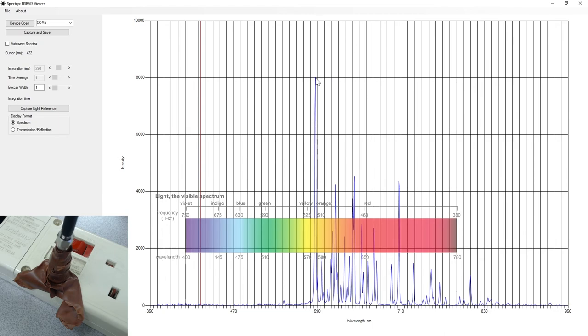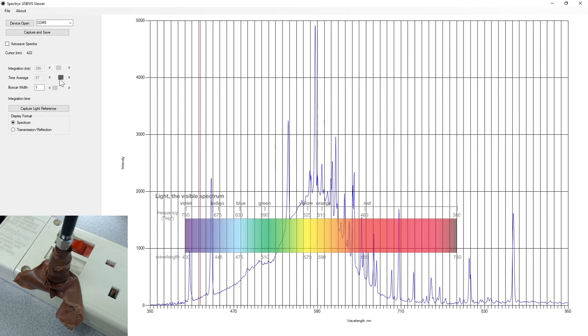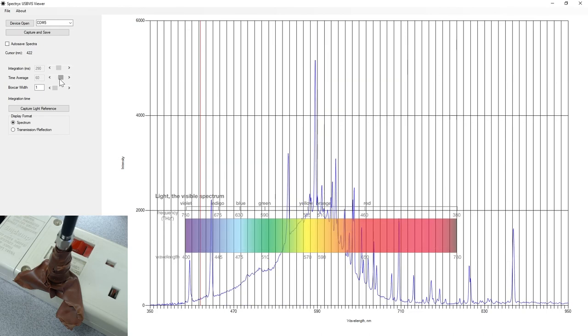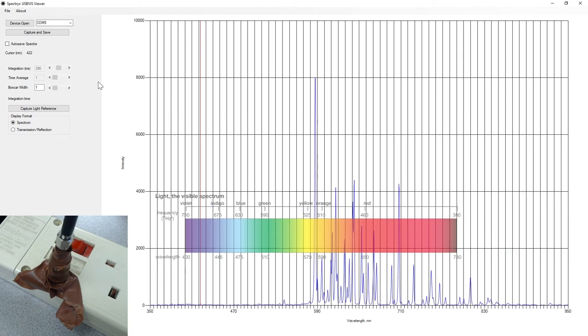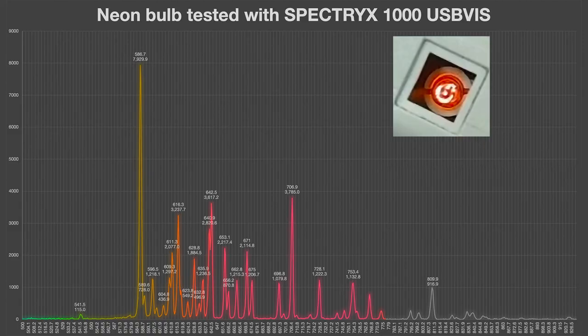It is peaking here, so by averaging it up—where do I have that average? Now it's actually looking back in time and seeing what it got from the compact fluorescent, so that's no good. But if we go to our most recent ones here, that is the neon spectra.